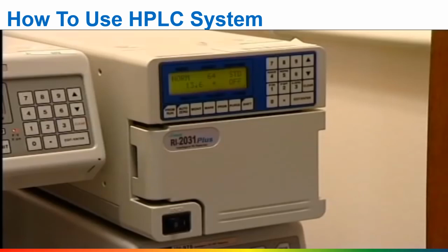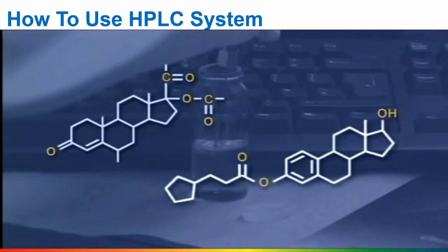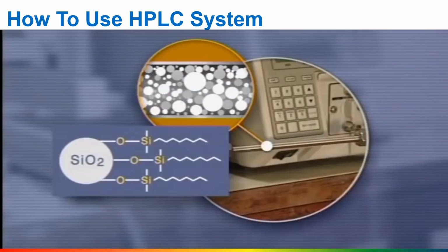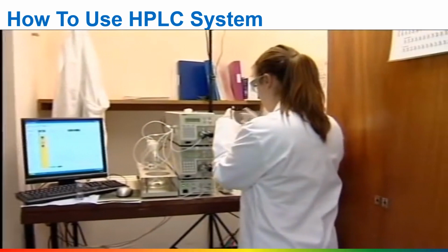Here, the HPLC instrument is being used to separate a mixture of two steroids used in a pharmaceutical preparation. The column chosen is packed with a nonpolar solid. The tails of the molecules represent hydrocarbon chains, C8H17. Having chosen the solvents, detector wavelength and flow rate, a single sample is run by injecting about 20 microliters into the injection port.